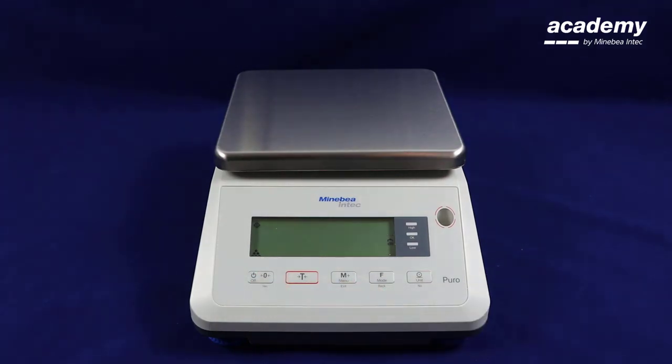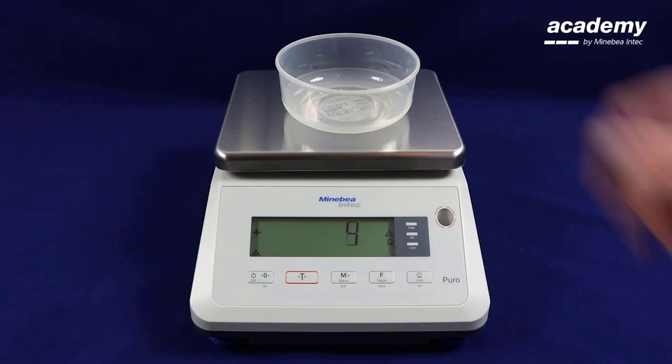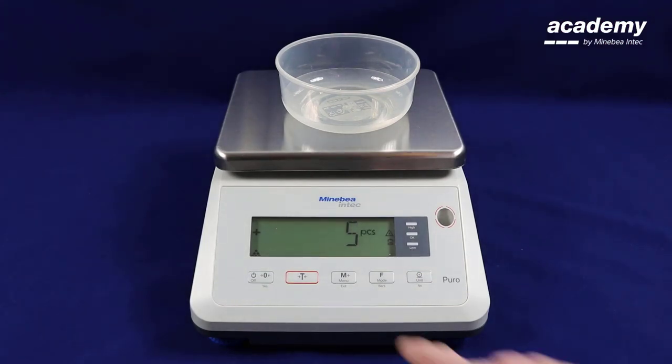Press zero to clear. As you can see, you are still in count mode. You can also set the tare by placing the container directly onto the scale and pressing the tare button.